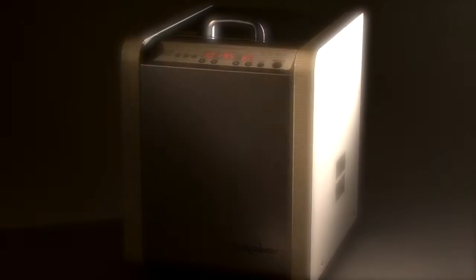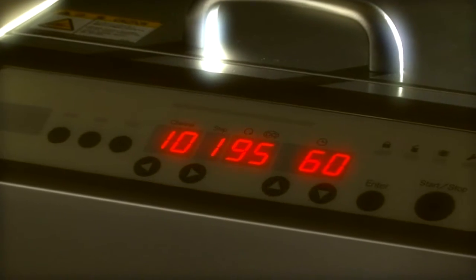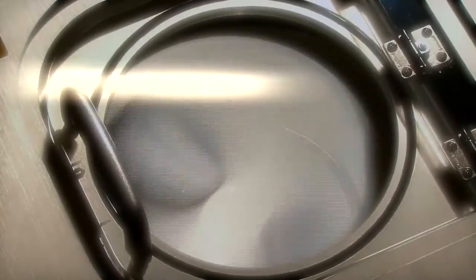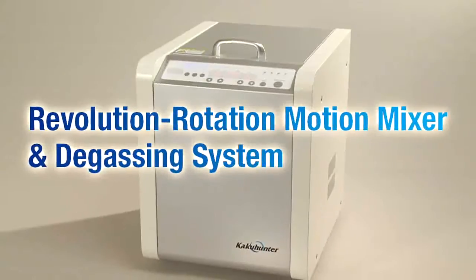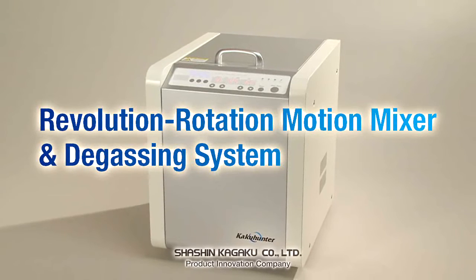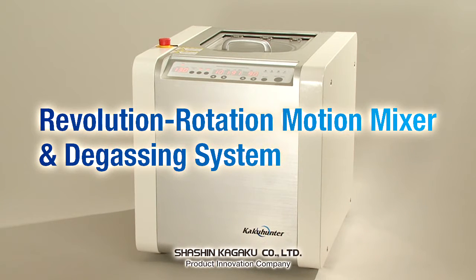A trusted expert in mixing and degassing. This functionally sophisticated mixer degasser from Shashin Kagaku allows users to set revolution and rotation speed separately, which makes it applicable to a wide range of fields and products including chemicals, cosmetics, and pharmaceuticals. The unit simultaneously mixes and degasses target materials despite the opposite nature of these two processes.